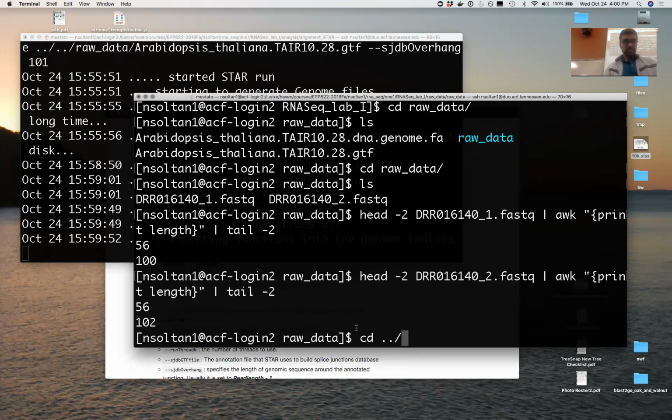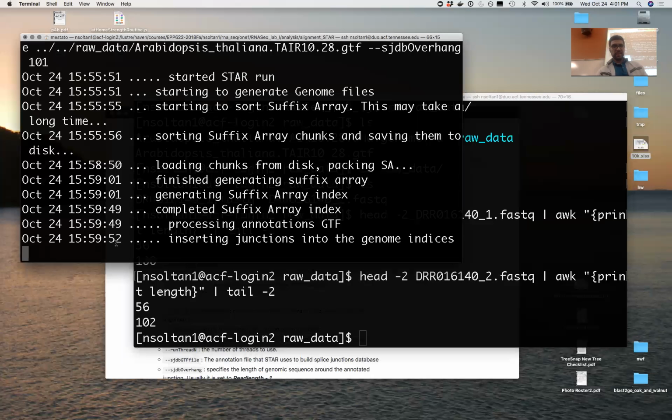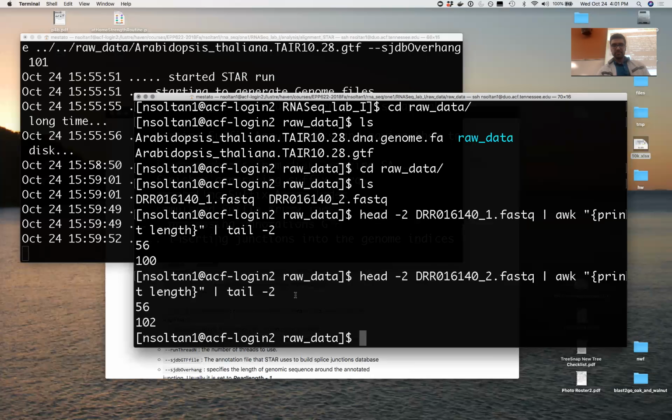Okay. But since it's going, could you just copy the annotation file and the reference genome that we just downloaded from your directory to your local computer, because we need those two plus 2 other files for our visualization. Could you please download them to your local computer while we are running the indices? It's exactly in the section of the website course, visualize with IGB. Just find those files in your raw data, the GTF file and the .fa file. Copy them to your local computer.